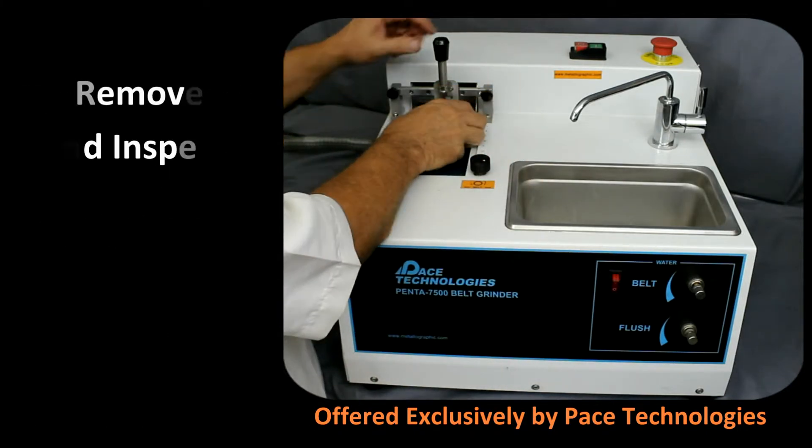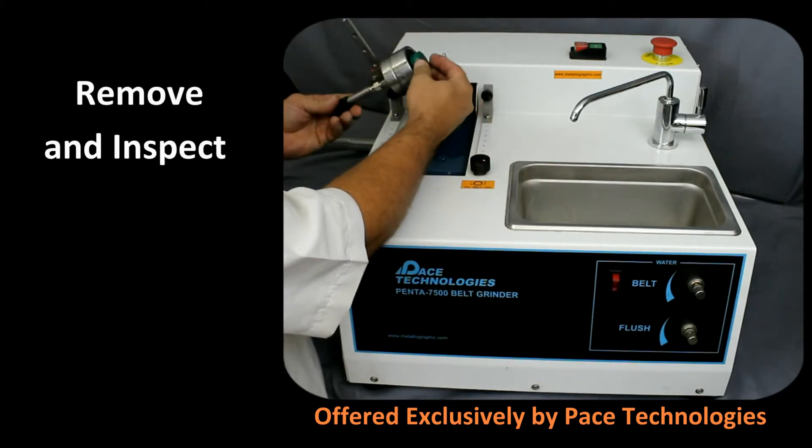To check the grinding process, swing the holder up and remove the mount for inspection.